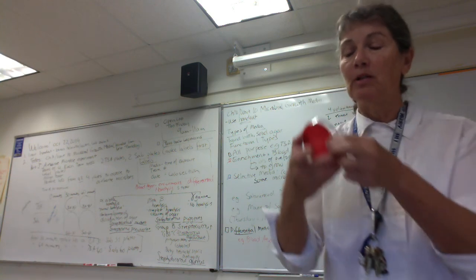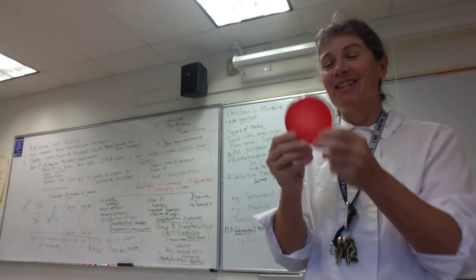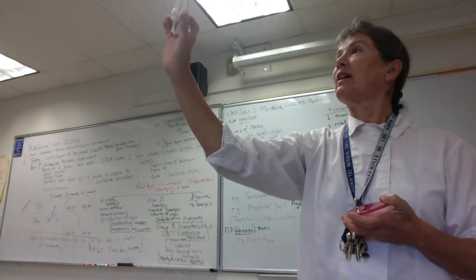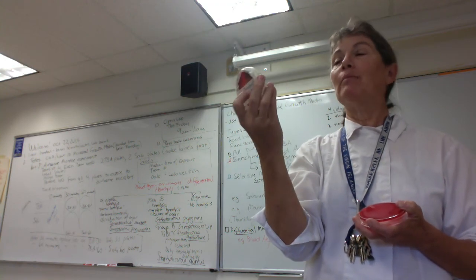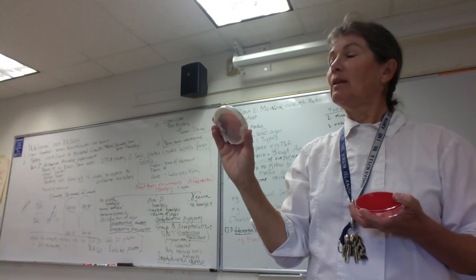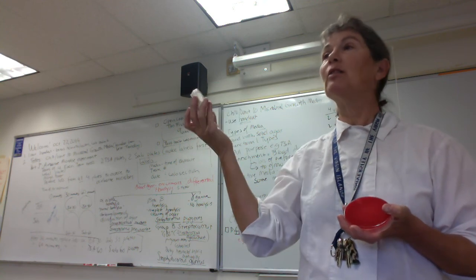And then, just like we did last time, I'm just going to make quadrants here. And it's all anonymous. We just use numbers, so nobody needs to feel uncomfortable. And then we'll do just as we did yesterday. We'll check for the alpha hemolysis and beta hemolysis. And again, you guys, if you have a sore throat and we have beta hemolysis, I know one of the folks yesterday had a sore throat, and I just don't remember which throat swab, but if that person with a sore throat is the one with the beta hemolytic colonies, I'm going to suggest that he or she goes visit their healthcare provider, because it could be strep throat.